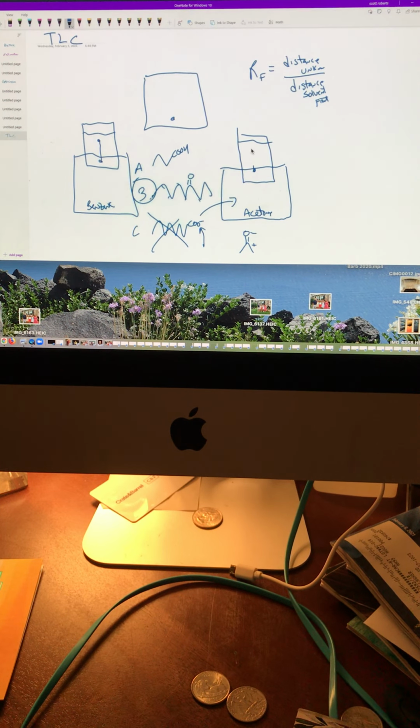This is nonpolar. And a nonpolar molecule is phobic and will travel better in benzene. Octanoate or heptanoate, those are negative. They will be philic. Got it. So for TLC, you got to know the solvent. The RF is literally something you look up depending on solvents, but it's really cheap to pour out a bunch of solvents, dot your unknown on a piece of paper, and just run it.